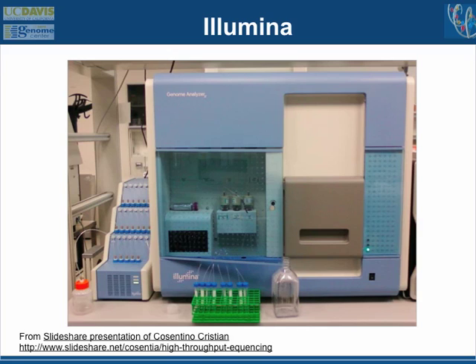Now, the Roche machine actually has different chambers. So you can add a little gasket onto it and separate them. If you had 8 different samples, you could know where they were on the little dish. The little mini machine has just 100,000 sequences all mixed together.